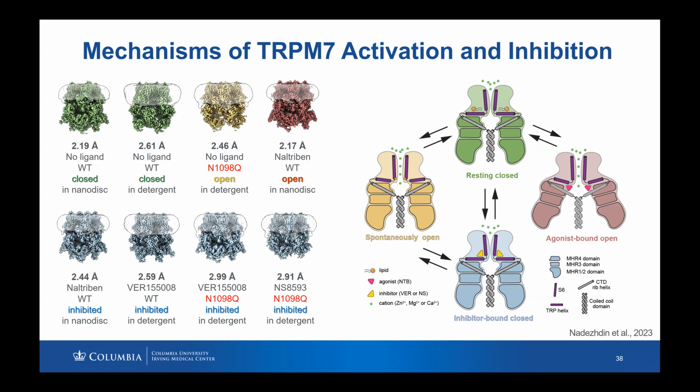But at least we didn't see it, so maybe the abundance is less than 10%, 5%, even fewer particles may end up in the closed state. And again, this is interesting because in single channel recordings, channels flick between closed and open conformations, but it looks like Cryo-EM conditions prime the channel to be in the open state.